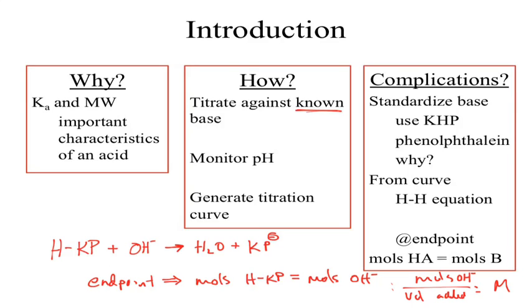That titration, particularly if you're good at it, won't take that long. We'll repeat that trial 3 times, and actually we're going to change it to 4. We're going to do that titration 4 times. Any idea why 4 times? Because you're working in partners. We're going to make 1 base solution per partners. You will each titrate twice. You can then swap data, average your results, and you've got the molarity of your base solution. If you're planning on working by yourself, you get to do 3 trials so that you can do a reasonable average.